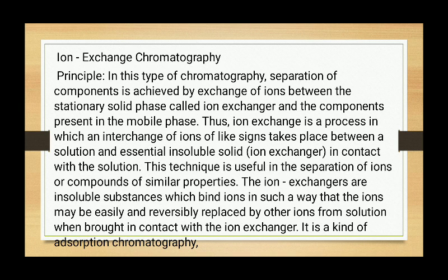The ion exchangers are insoluble substances which bind ions in such a way that the ions may be easily and reversibly replaced by other ions from solution when brought in contact with the ion exchanger. It is a kind of adsorption chromatography.